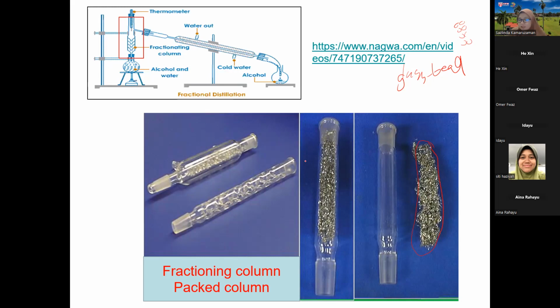Do you have any idea before we discuss further? Why is this fractional column important in fractional distillation? Do you have any idea before we discuss in detail?